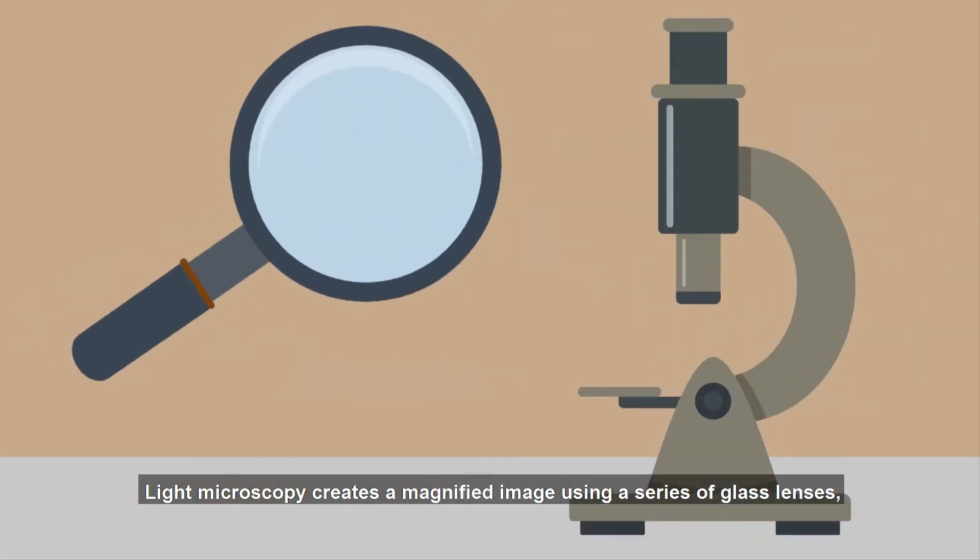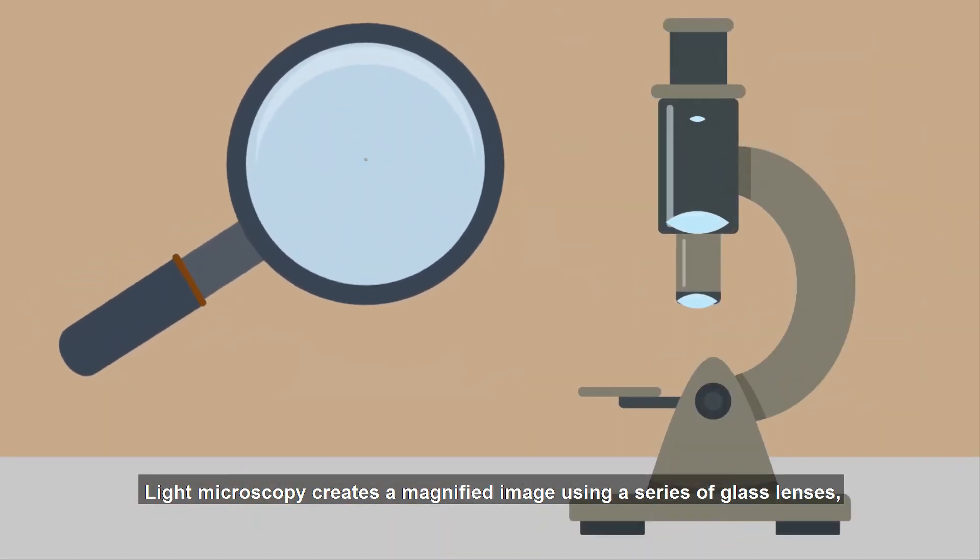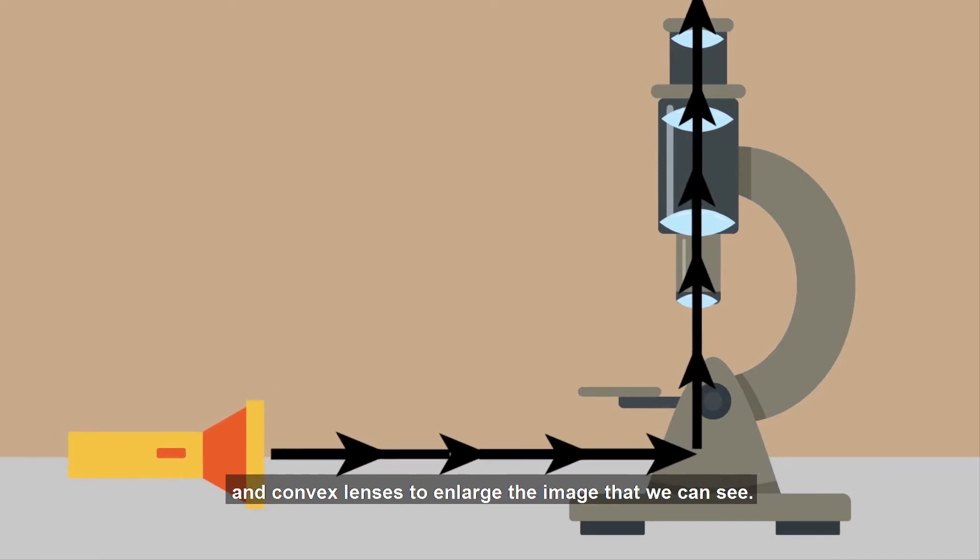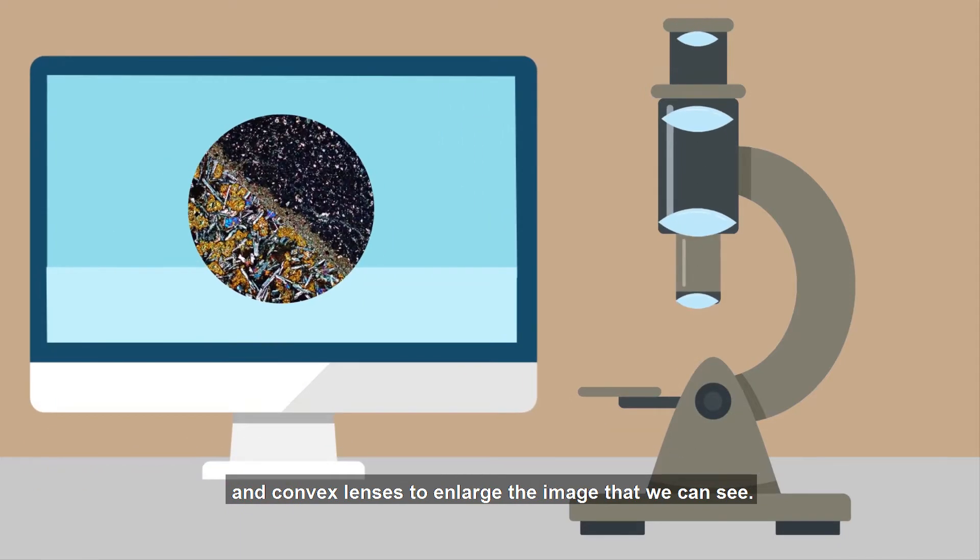Light microscopy creates a magnified image using a series of glass lenses, which first focus a beam of light onto or through an object, and convex lenses to enlarge the image that we can see.